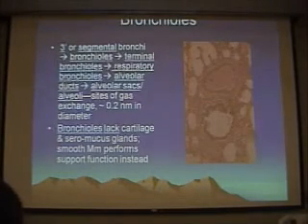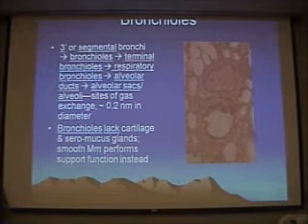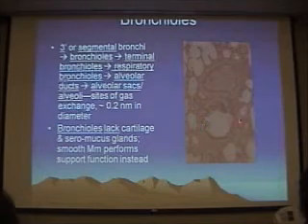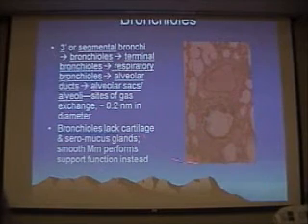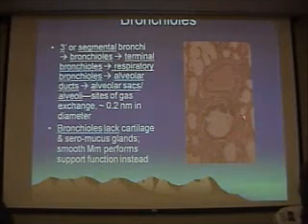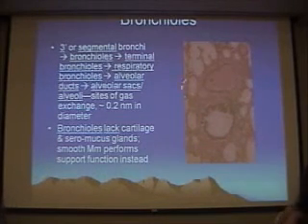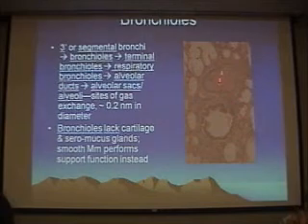Bronchioles, unlike bronchi, lack cartilage support. So when you look at a bronchiole, you see that nice respiratory epithelium, but no cartilage. Instead, you see a little smooth muscle for support. Commonly, you see adjacent to that bronchiole a blood vessel, an arteriole, filled with blood.